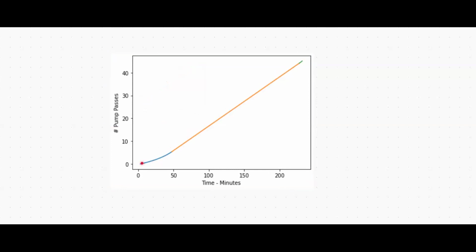So, what I was saying, I just wanted to draw quickly. If you get a lot of flux decay, your pump passes, this is the first concentration step, what you'll get with a lot of flux decay is something like this.